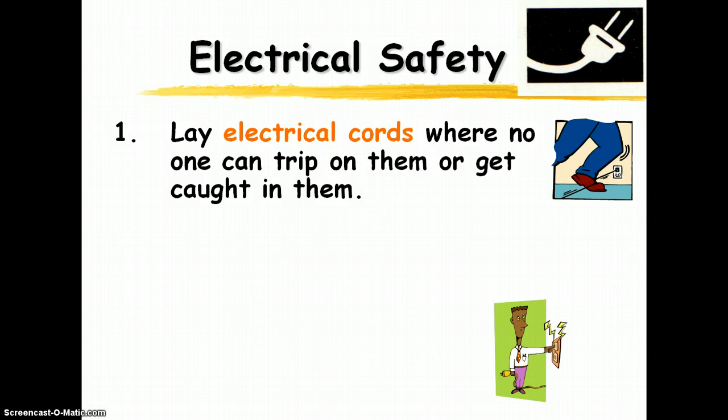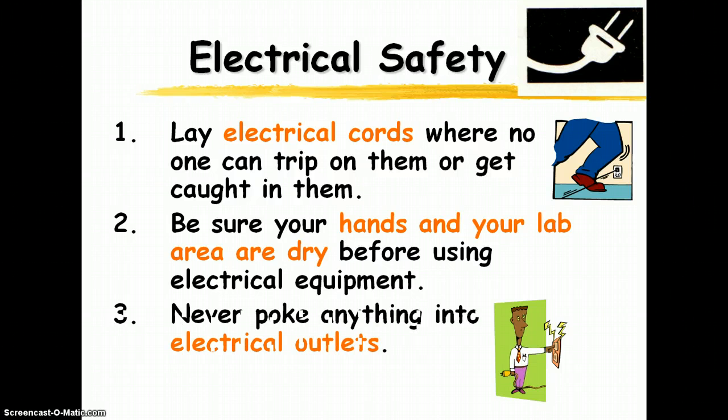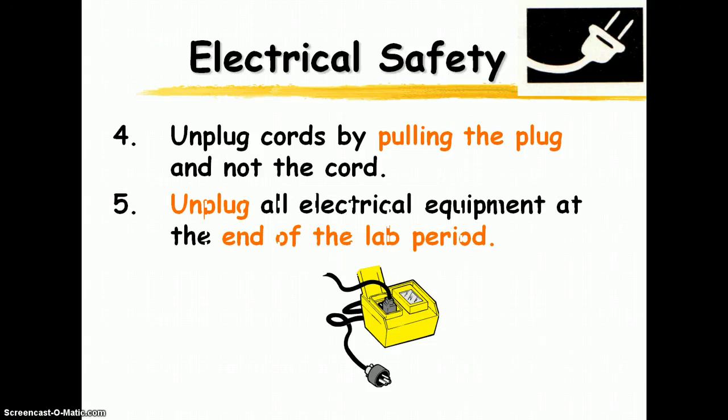For electrical safety: don't leave cords lying around where people can trip on them. Make sure your hands and your lab area are dry before touching anything electrical — if your hands or anything else is wet, do not touch electrical equipment. Nothing goes in the electrical outlets except the plug. When unplugging, pull the plug itself, not the cord. Make sure everything is unplugged at the end of the lab period.